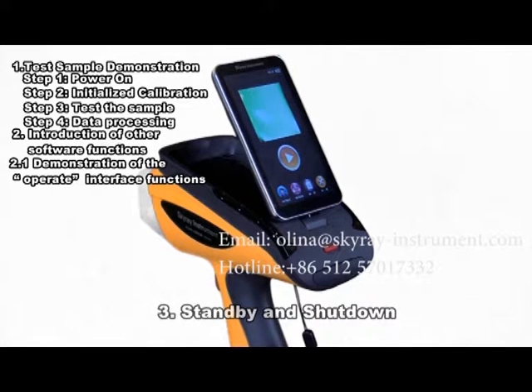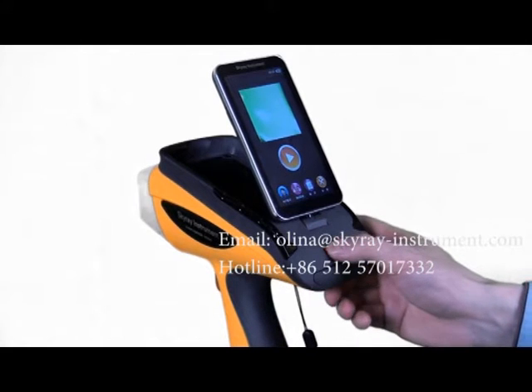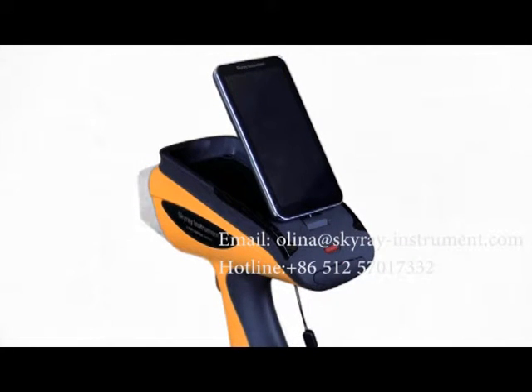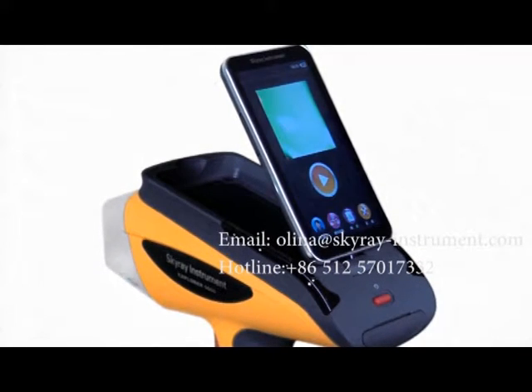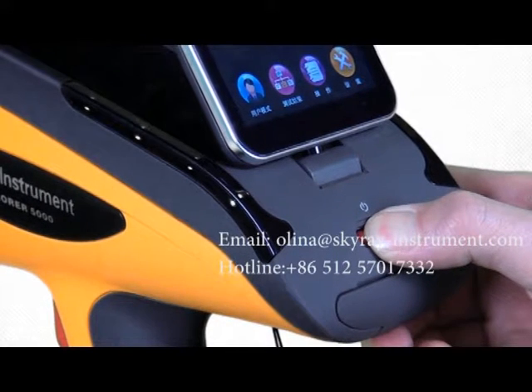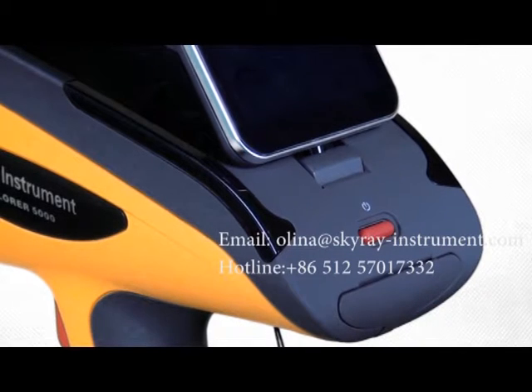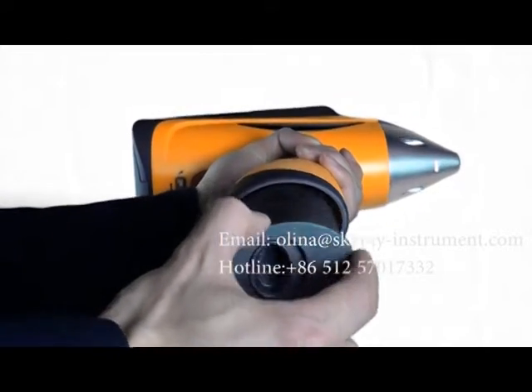Section 3: Standby and Shutdown. Standby — when the instrument is normally activated, press the switch button for one second and then release it; the instrument will enter standby mode. Wake up — in standby mode, press the switch button for one second and release it to exit standby. Shutdown — in normal operation, keep pressing the switch button for over three seconds and the instrument will automatically shut down. Finally, remove the batteries and store the instrument.